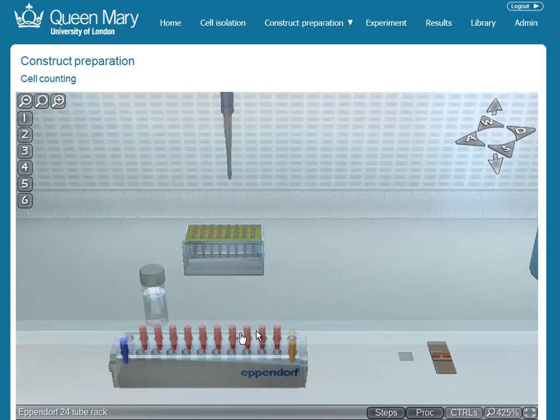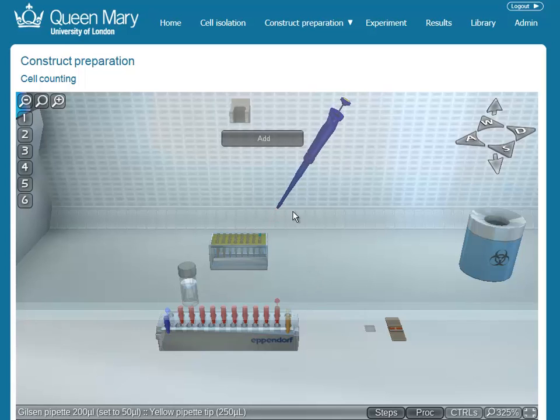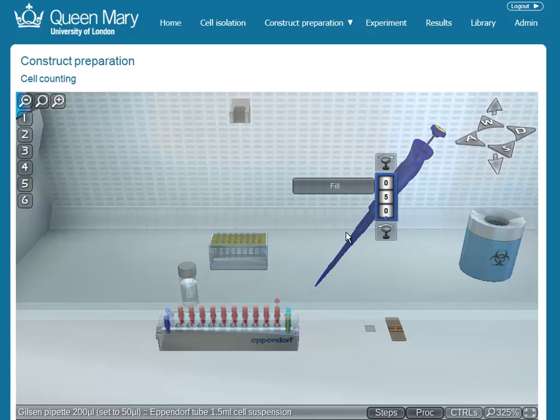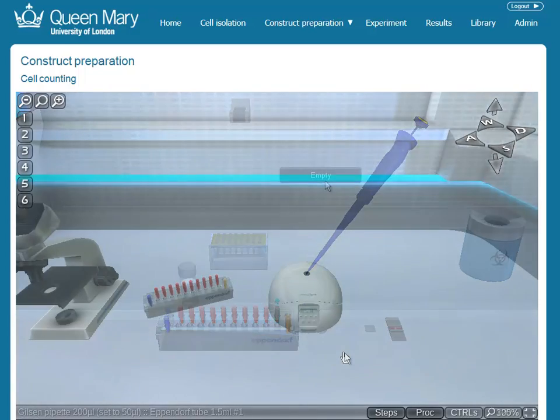Students can use the virtual lab to both practice before real lab sessions and get to do things not possible in a real lab. They can rehearse complex tasks that require multiple pieces of equipment to work together, and as liquid handling is built into the platform, common lab tasks like pipetting are supported.